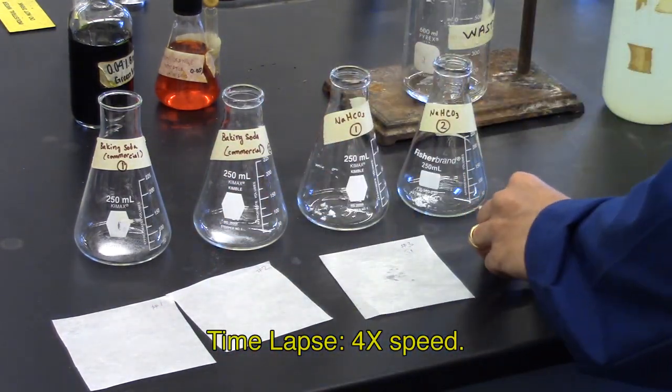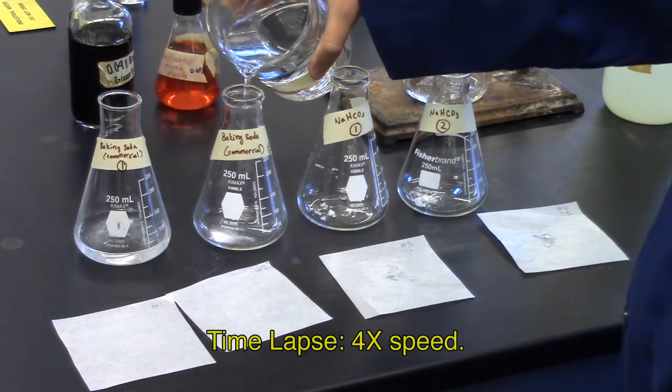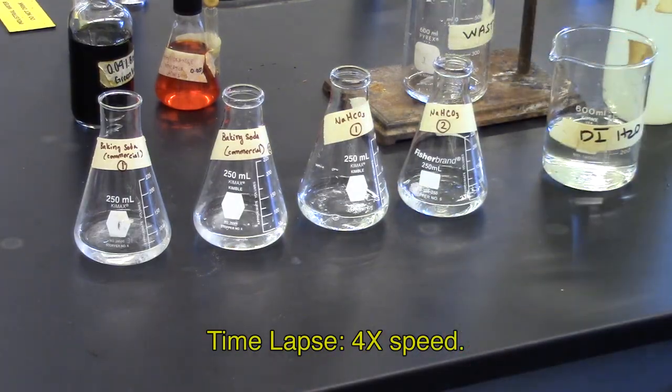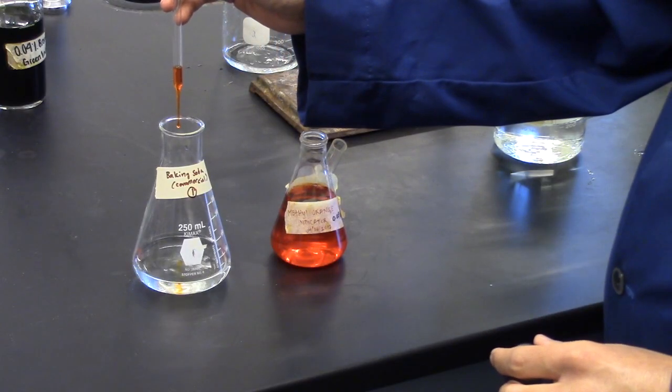To each flask, add approximately 50 milliliters of water. You may use the marks on the flask. To each flask, add three drops of indicator.